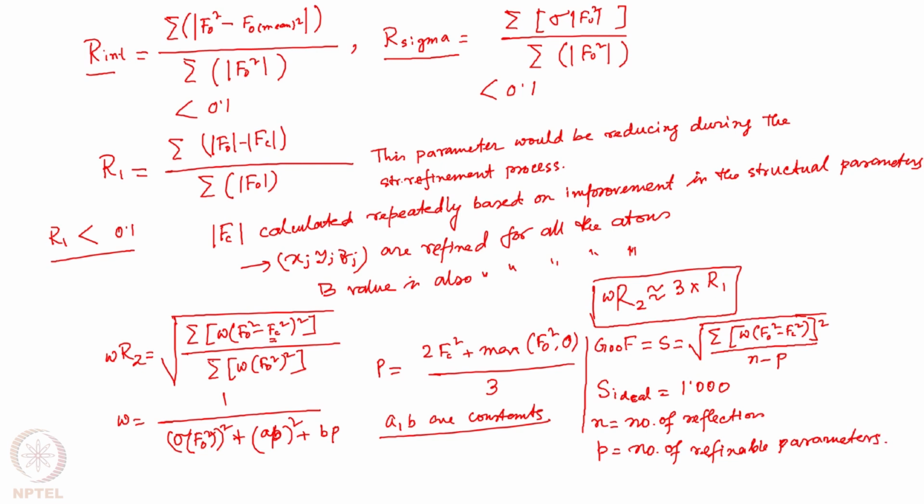So during this structure refinement process, we keep an eye on all these parameters and try to reduce or minimize them, or in the case of GOOF, we try to make it close to 1 by making appropriate corrections and alterations during the structure refinement process. The interest here is always to identify the atoms correctly, assign them appropriate occupancies, and refine it a few cycles.